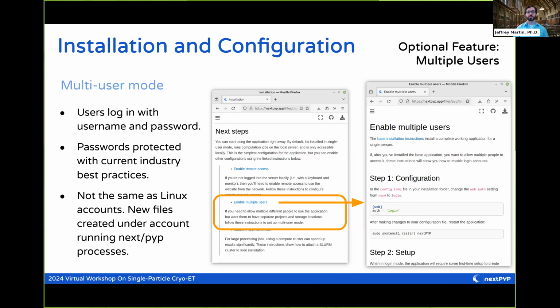Because storing passwords is very difficult, we try to use state-of-the-art techniques to store passwords safely and securely. So hopefully you can trust that your passwords will be stored safely in our software.